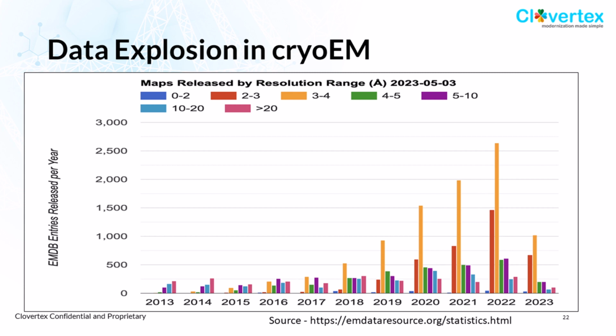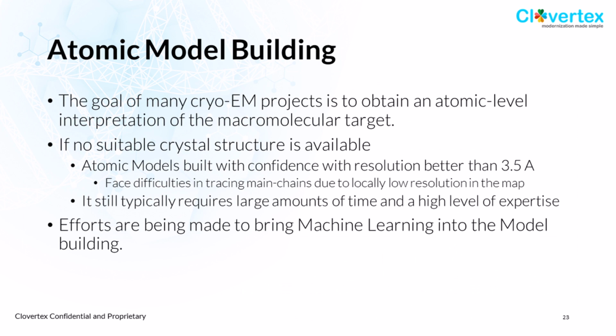But there is a fair number of data points which have so-called worse resolution, in the sense that the higher the number, the worse the resolution. And Dr. Kihara and his lab is actually working on models which will allow analysis of the lower resolution data which is coming in. And we'll actually talk about that very quickly.